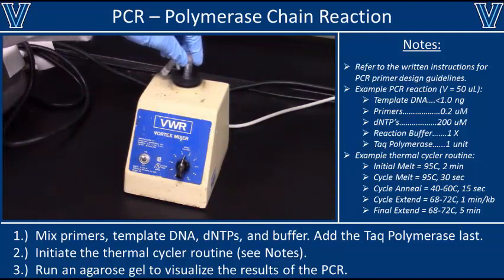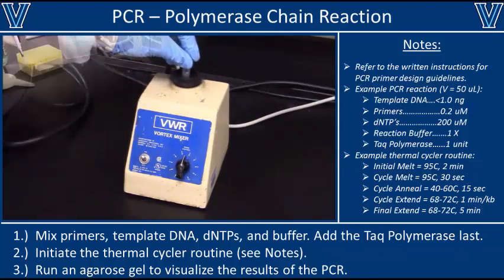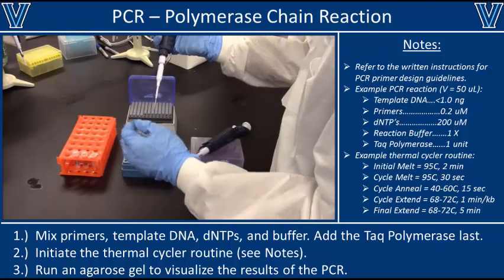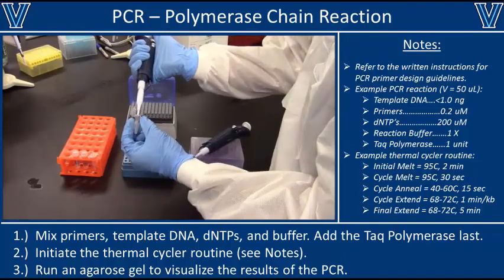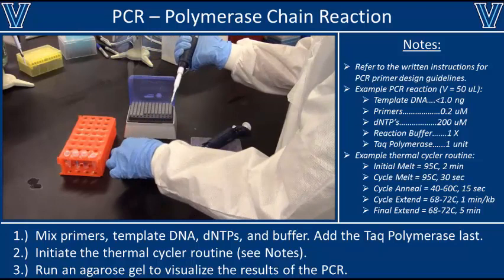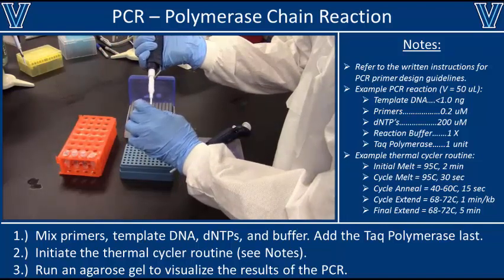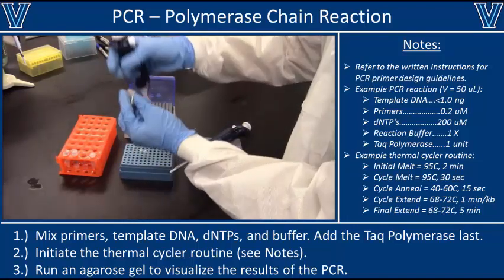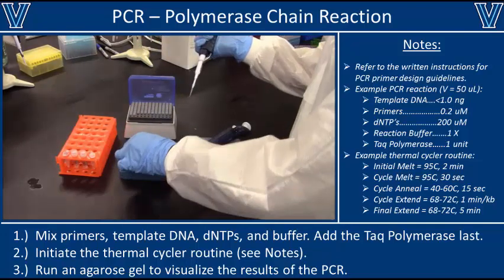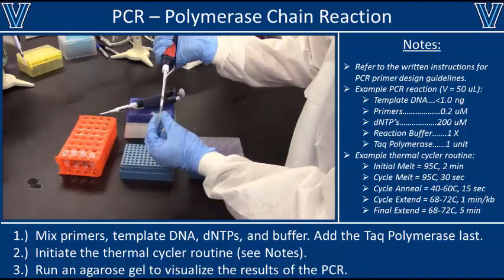Once your primers and template DNA are fully thawed, vortex them briefly to make sure they are completely mixed. Get a new 0.2 ml PCR tube. Begin by transferring 1 nanogram of template DNA into the PCR tube — this can be as little as 0.5 to 1 microliter, so work very carefully. Next, add 1 microliter of each of the forward and reverse primers, ensuring a final primer concentration of 0.2 micromolar. Finally, add your PCR master mix to the tube and pipette it up and down a few times to make sure everything is well mixed.